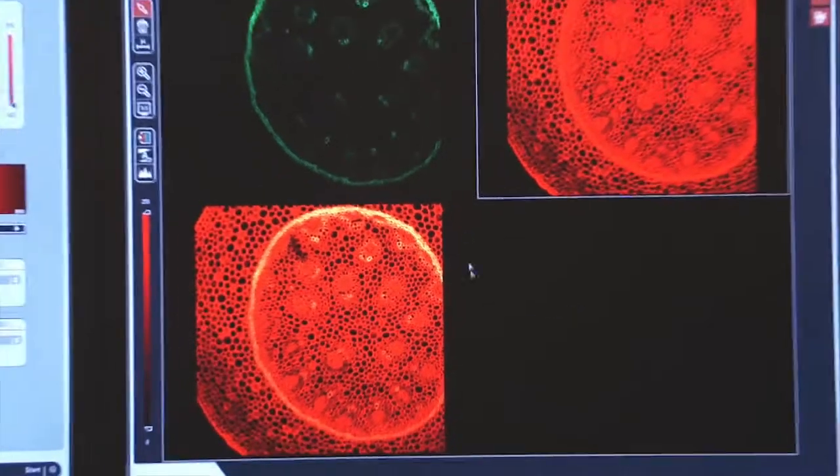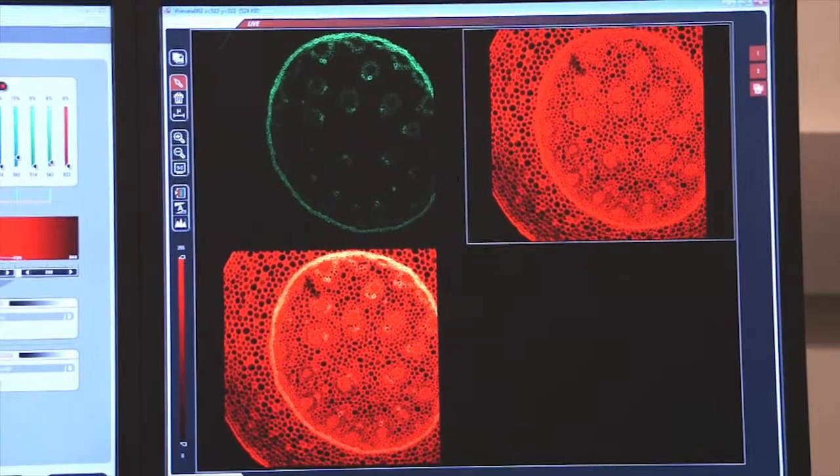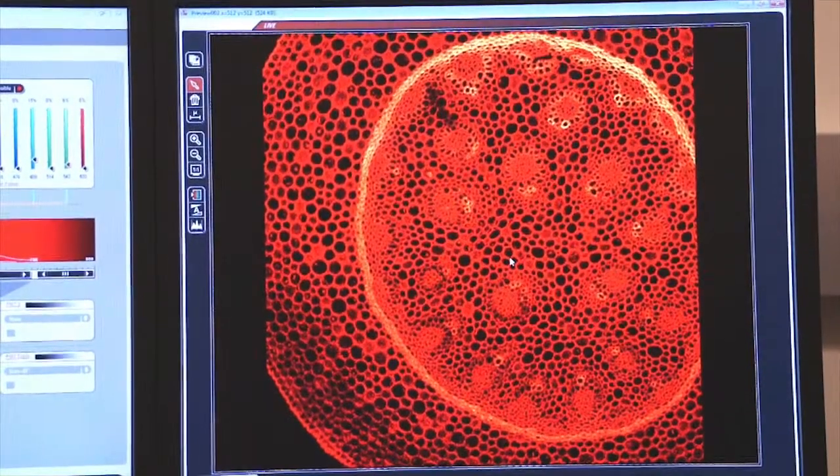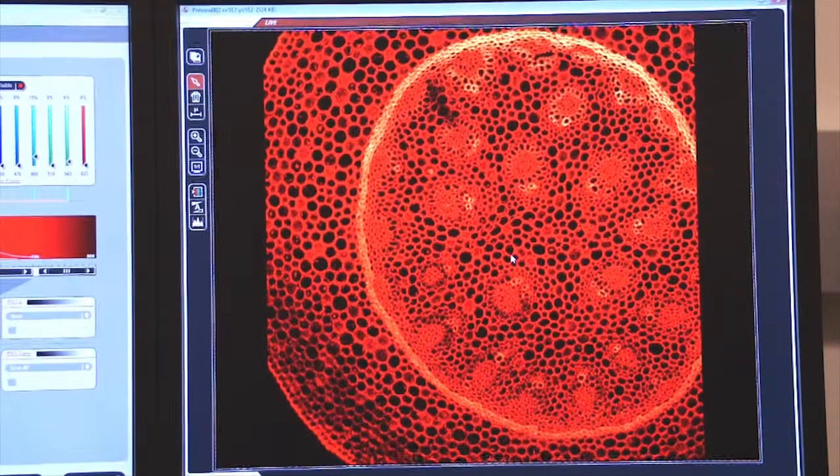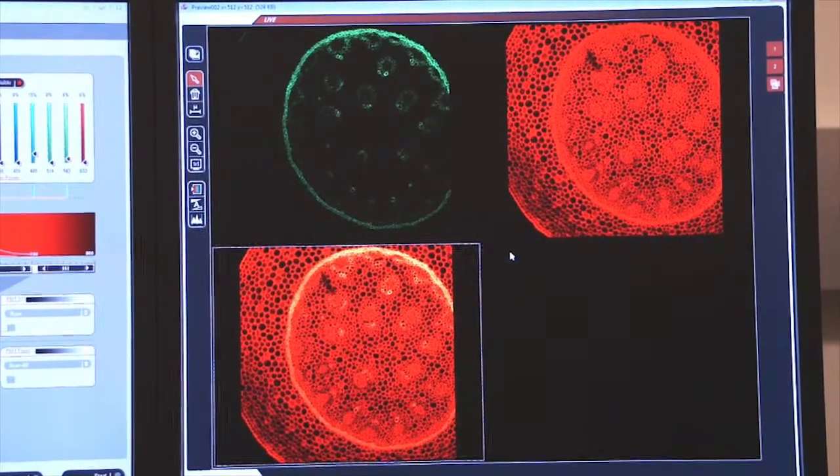Once again, I will double click on my image and again I can see my two captured images and my composite image which is generated by the computer.